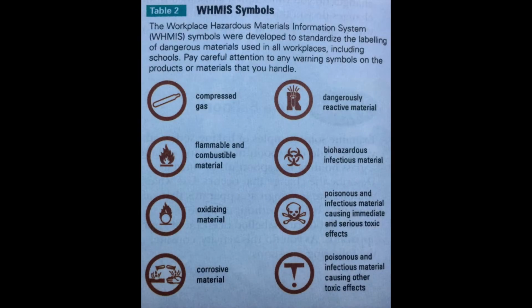And then we have Table 2, WHMIS symbols, the Workplace Hazardous Materials Information System. WHMIS symbols were developed to standardize the labeling of dangerous material used in all workplaces, including schools. Pay careful attention to any warning symbols on the products or materials that you handle.